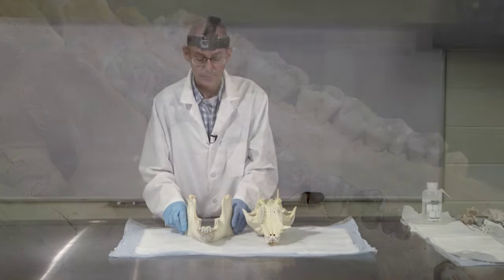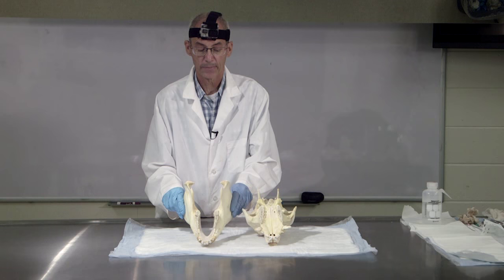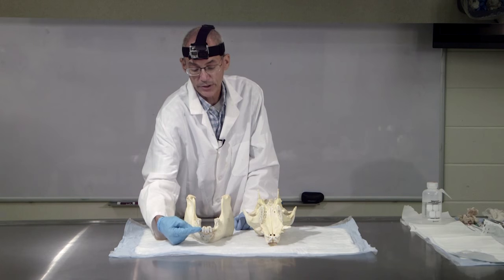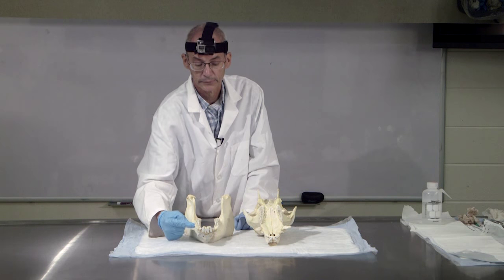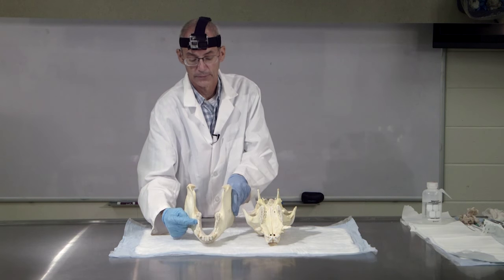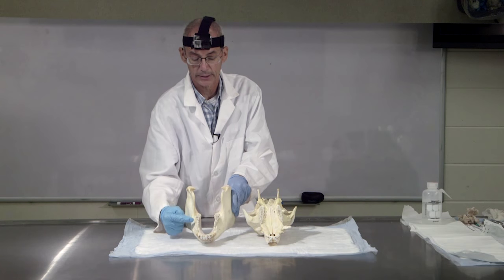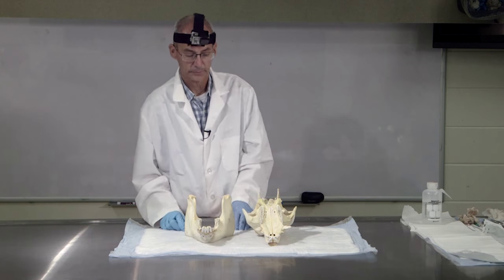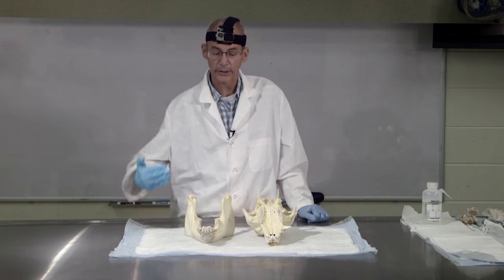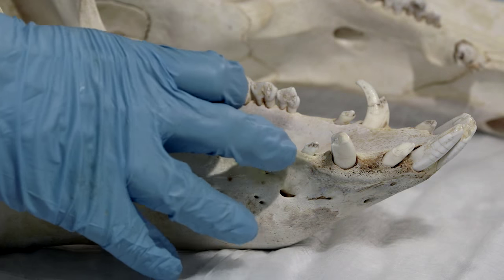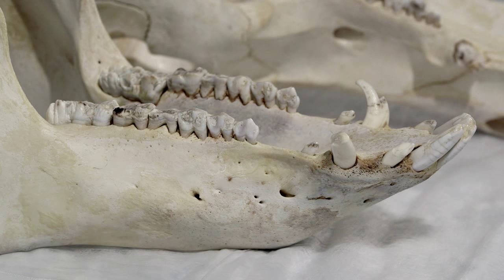If we look on the bottom jaw, we see essentially the same thing: three incisors, then a canine, then four premolars, and three molars. Just like the upper jaw, incisors and canines are primarily for food acquisition, and premolars and molars are primarily for food processing — in this case, grinding.